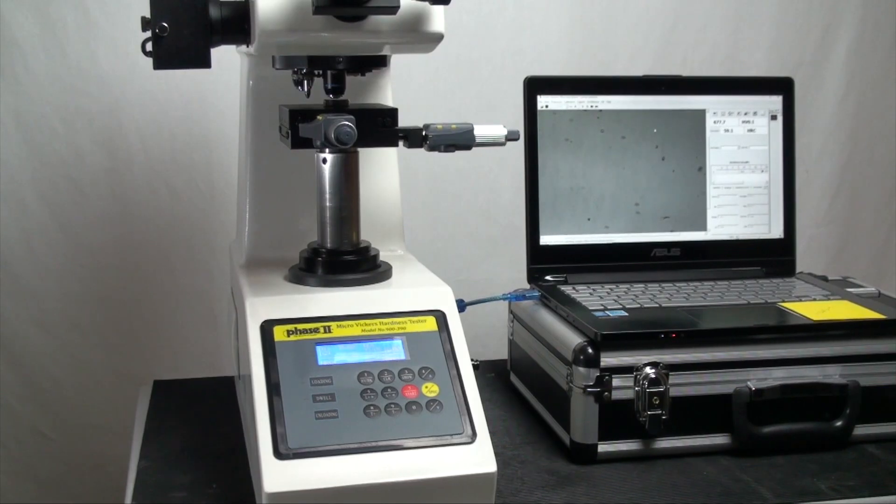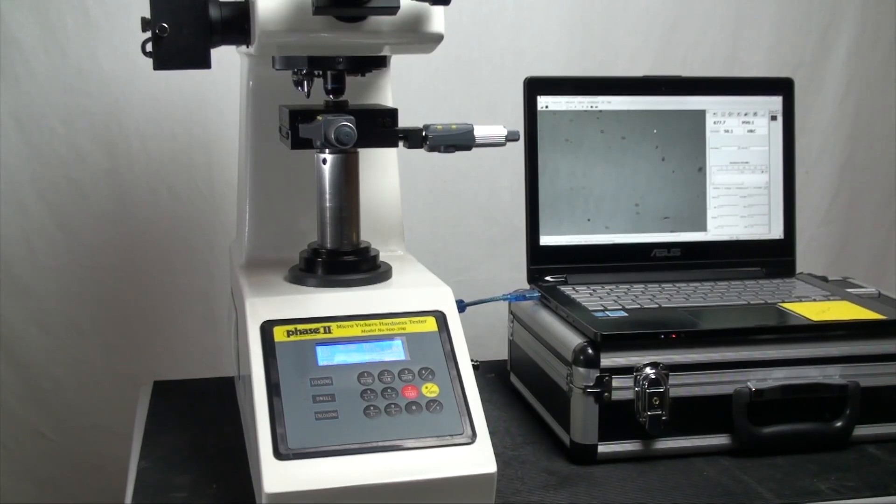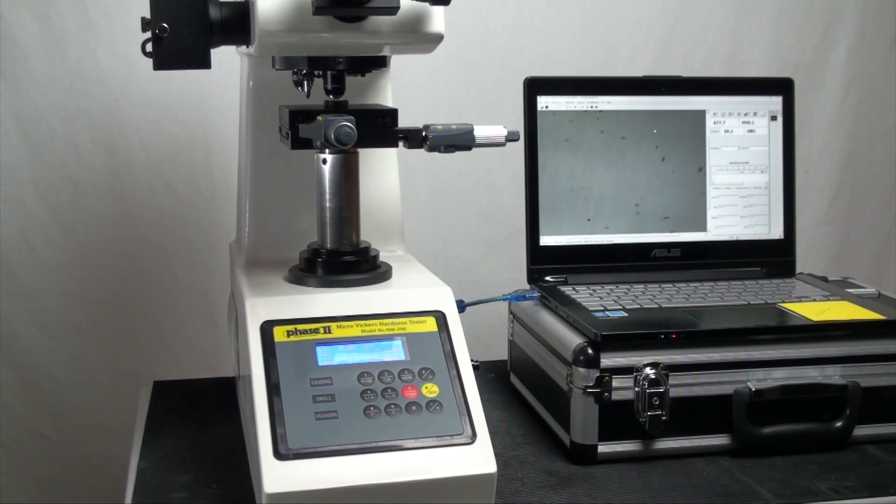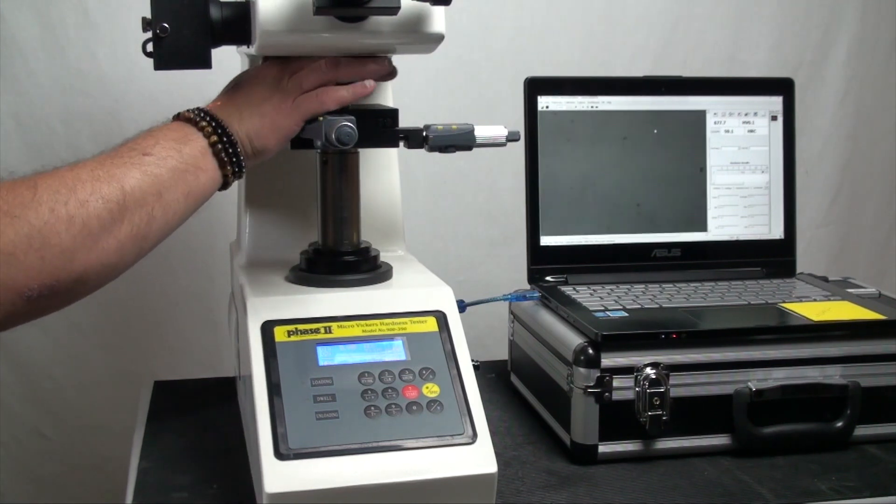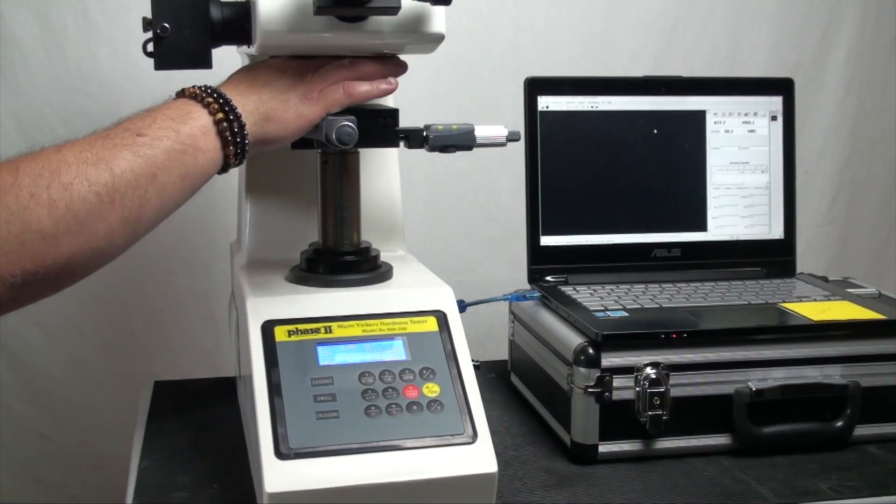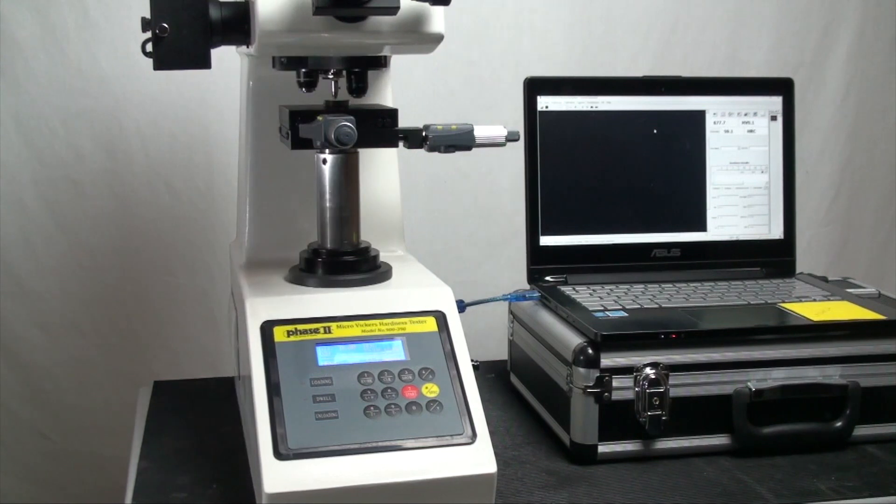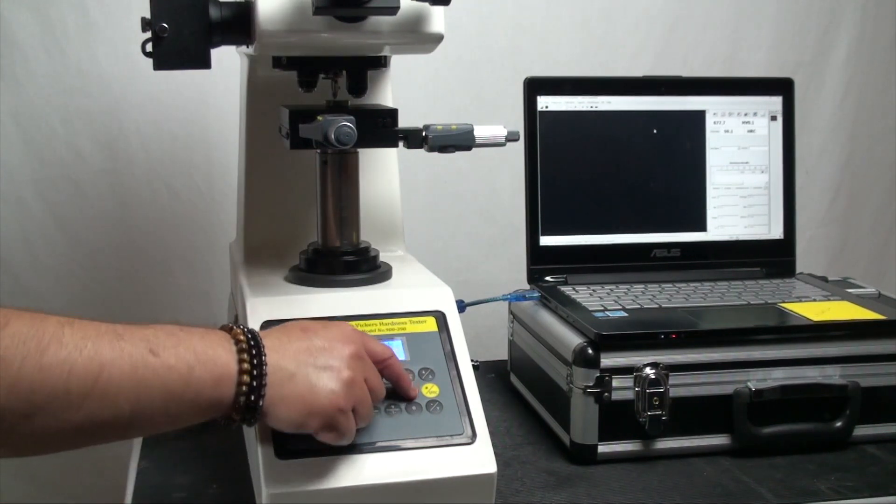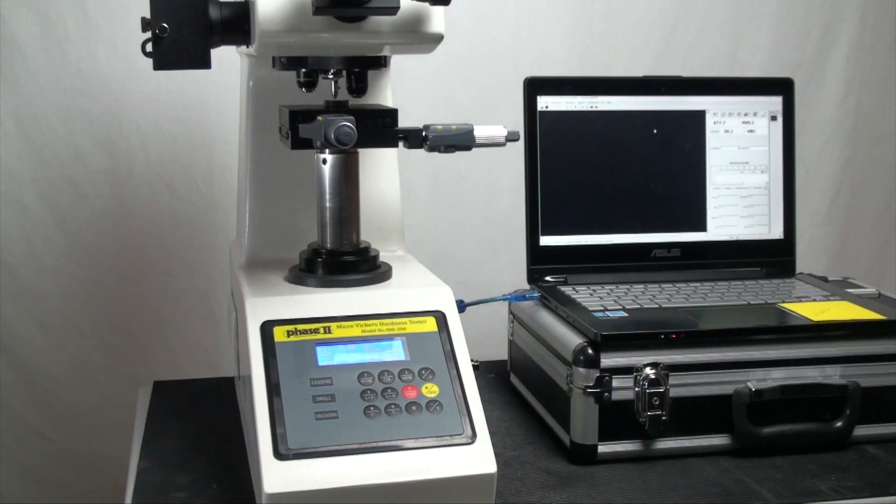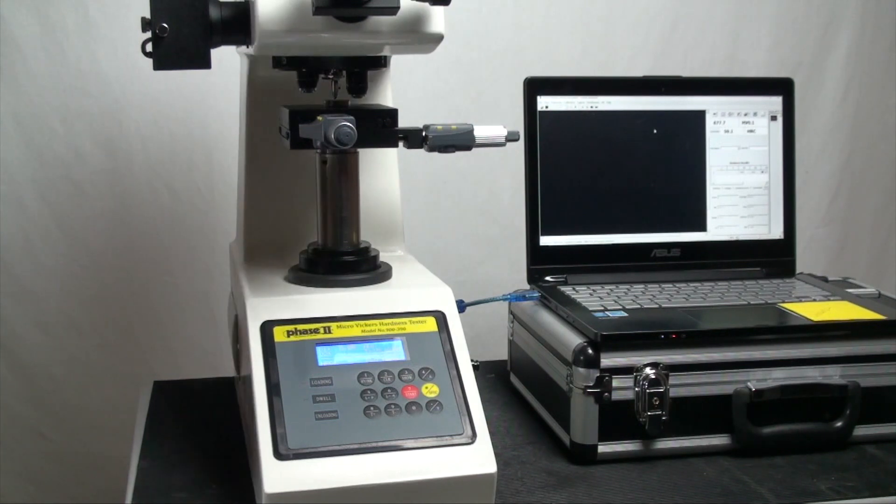Once you have determined a position to take a test, manually change the turret so that the penetrator is in position. Press the red start button and the instrument will begin by putting the load on.